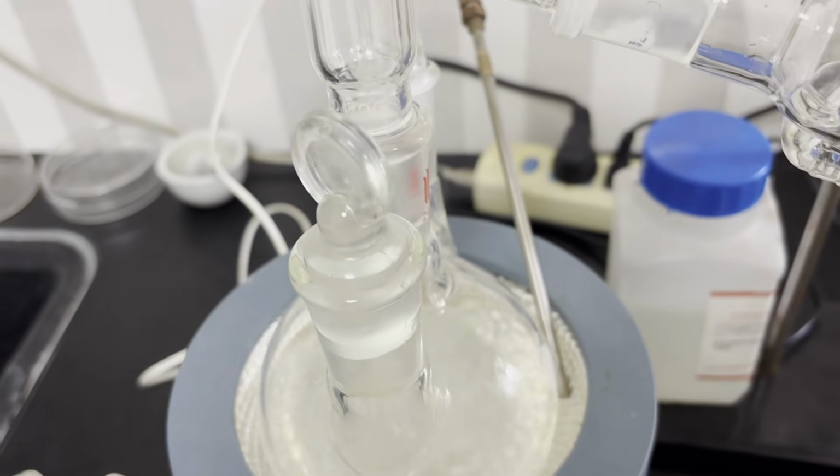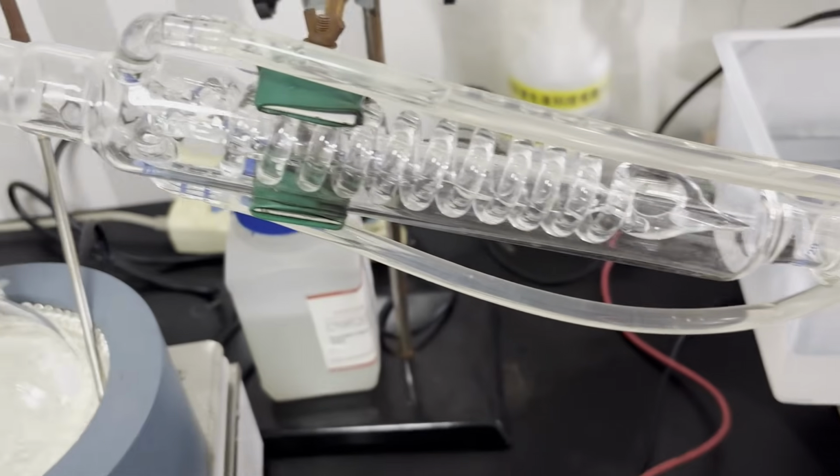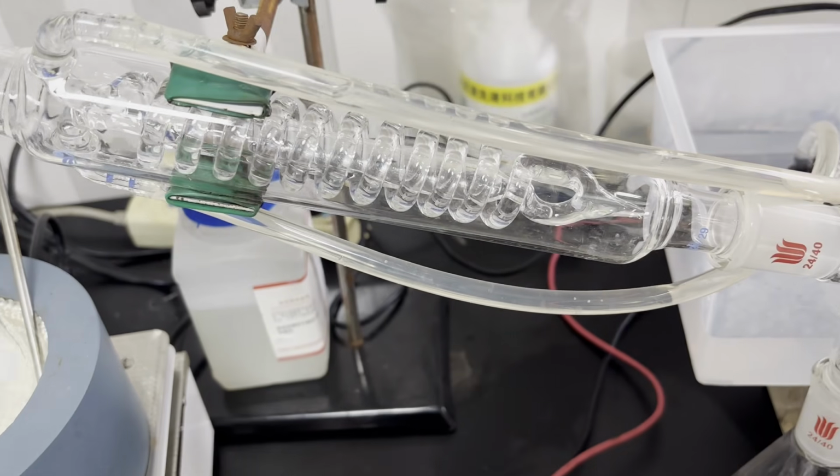Acetone, being the simplest ketone, is a great solvent and reactant for many kinds of organic reactions. Most people can obtain it easily, but sadly it isn't that available in some regions in its pure form.